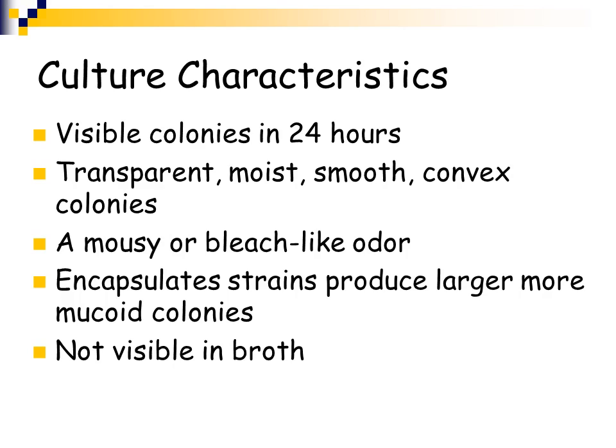However, textbooks still refer to the odor. When you open up a plate in the laboratory to do a catalase test or an oxidase test, sometimes the smell just hits you, and you don't even have to sniff the plate. So we do still describe the odor of certain organisms if it's very characteristic. Now, encapsulated strains will produce a larger and more mucoid colony. Of course, that's common because capsule-producing organisms usually look more mucousy.